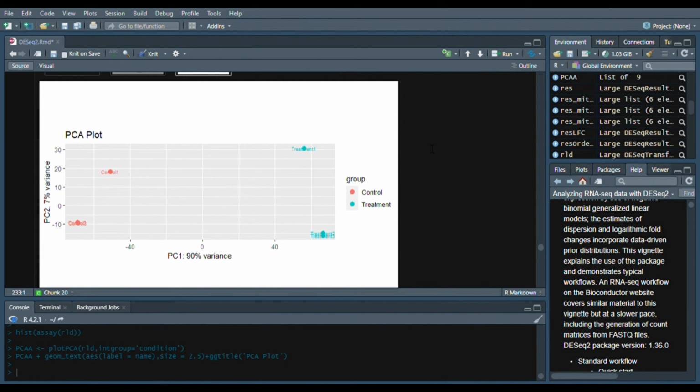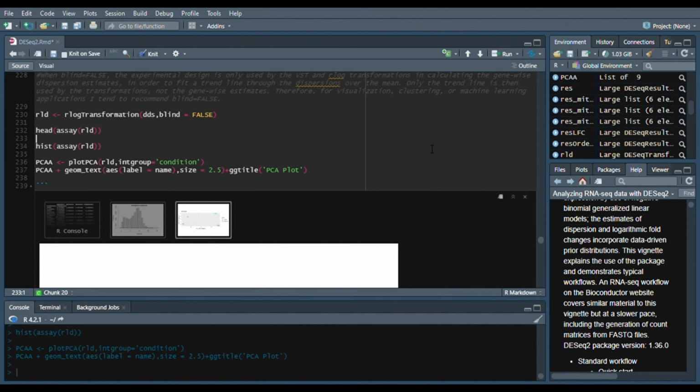When using these unsupervised clustering methods, log2 transformation of the normalized counts improves the distances clustering for visualization. DESeq2 uses a regularized log transform of the normalized counts for sample-level quality control, as it moderates the variance across the mean, improving the clustering. Blind equal to false should be used for transforming data for downstream analysis, where the full use of the design information should be made. Blind false will skip pre-estimation of the dispersion trend if this has already been calculated.